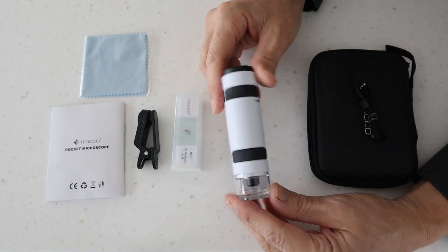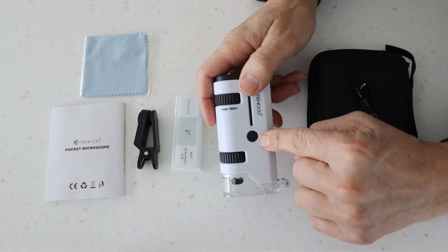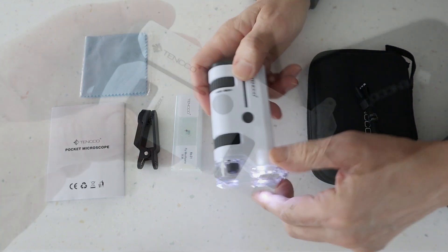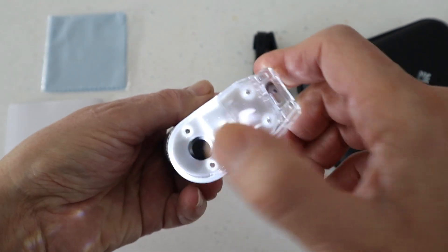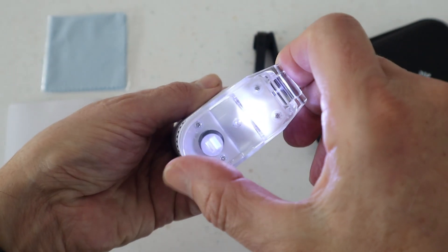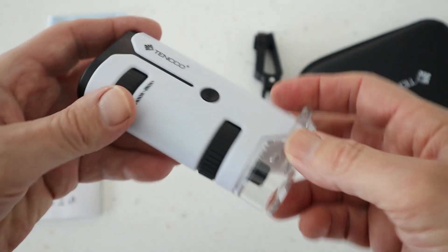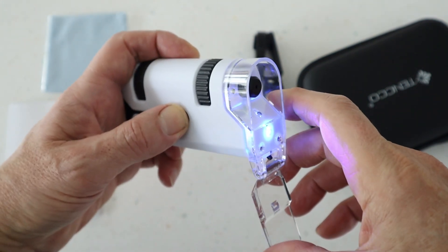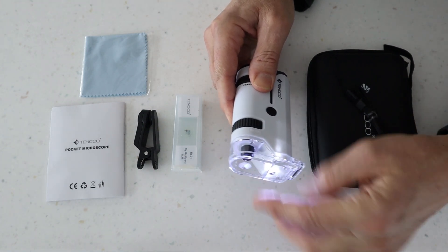With the battery in, regarding the lights: you have two light buttons. You have a UV light on one side and an LED light on the other. With the LED light, if you just press once, you can see the LED light comes on and there are two little prisms here that light the object up from the side. If you want to light the object from overhead, you simply open this flap and the light changes to a more overhead position — a really great two-in-one option. If you close it, it switches back to the prism light coming from underneath.